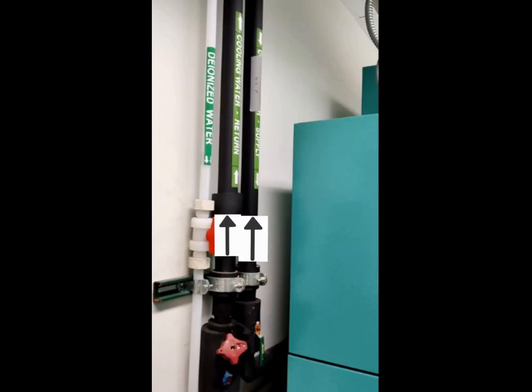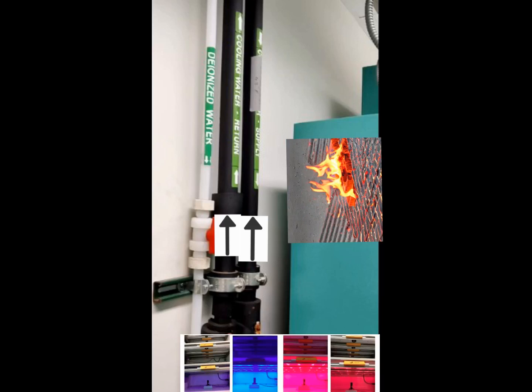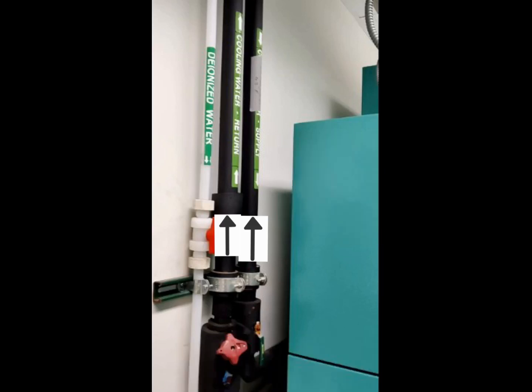The two pipes on the right are for transporting cooling water in and out of the system. This cooling water is used to remove excess heat that is generated by the machine from all of the lighting and climate control settings it can do. Once it absorbs the heat, the water exits the machine where it's cooled again before re-entering the machine to do the same thing of cooling the system down.